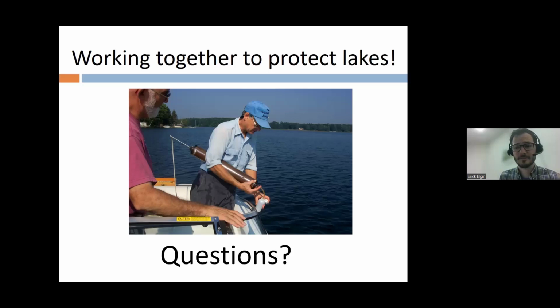Next question. I think you covered this after it was asked, but Craig asked, if turn-in for the spring sample is in June, how do I properly store my sample until then? Well, we keep it frozen. So it comes off the lake, make sure everything's in its baggie and labeled nicely, and make sure there's all that headspace in there, and put it in the freezer until that turn-in date. We want to keep it frozen by the time it gets to our drop-off locations. Great. Yep, that's super important.